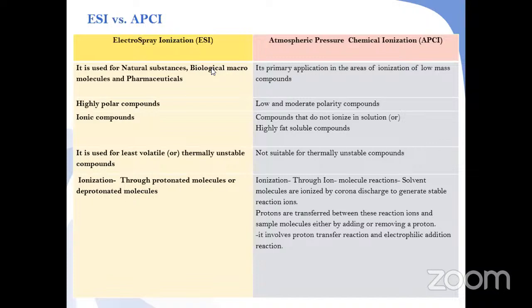Generally, the APPI method ionizes the analyte by an irradiation technique. In this technique, short wavelength vacuum ultraviolet light is irradiated, as photoionization, and the analyte is ionized when its ionization energy is lower than the photon energy.